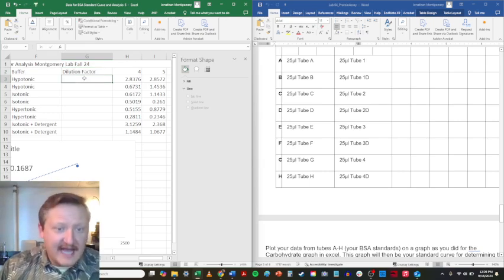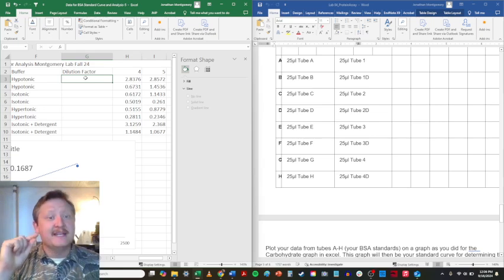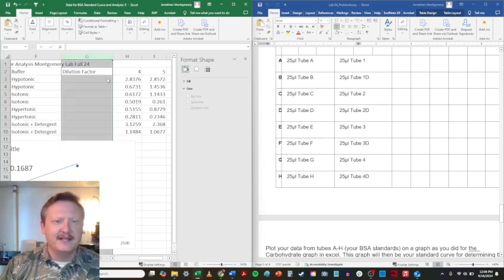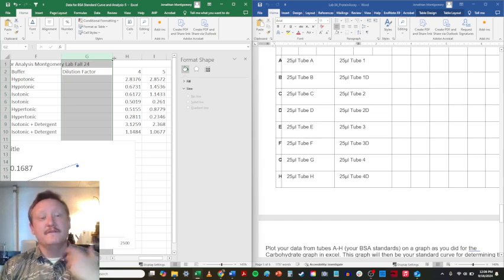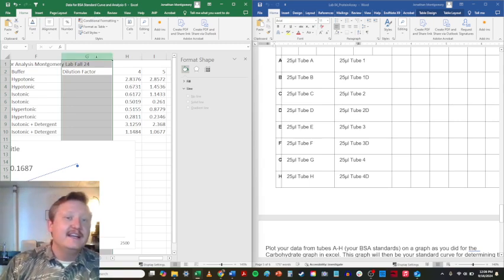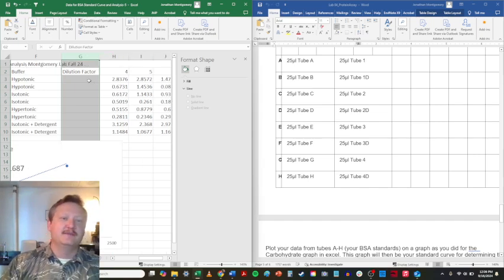The dilution factor is the number in the denominator of a dilution that has 1 in the numerator. That's at least how we're going to talk about it. So what I mean is when we do 1/5 dilutions, the dilution factor is 5. That'll make our math easier in a second. Now that column's a little large, so I'm going to resize it with that same trick I used before.